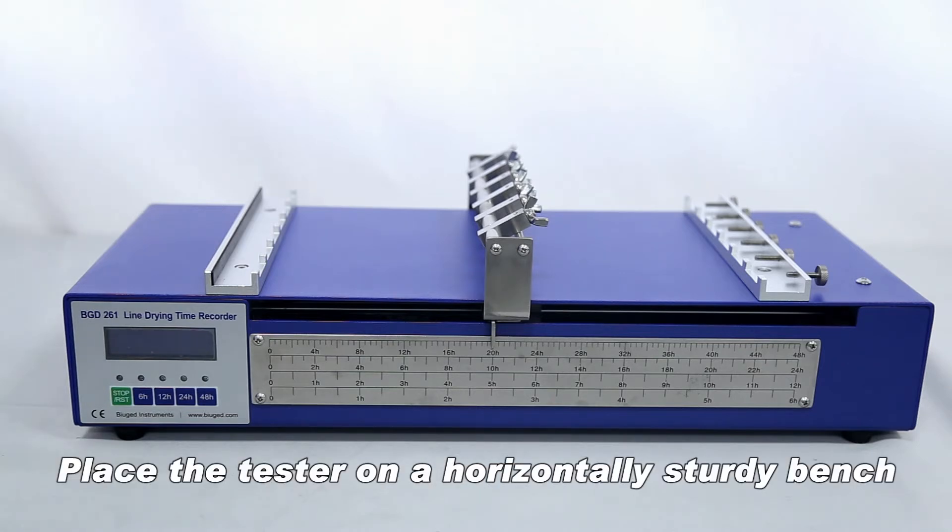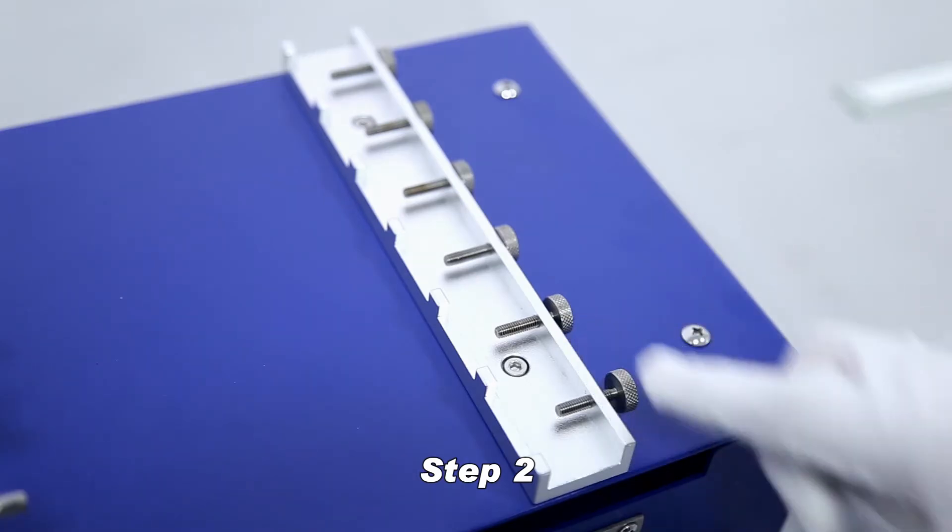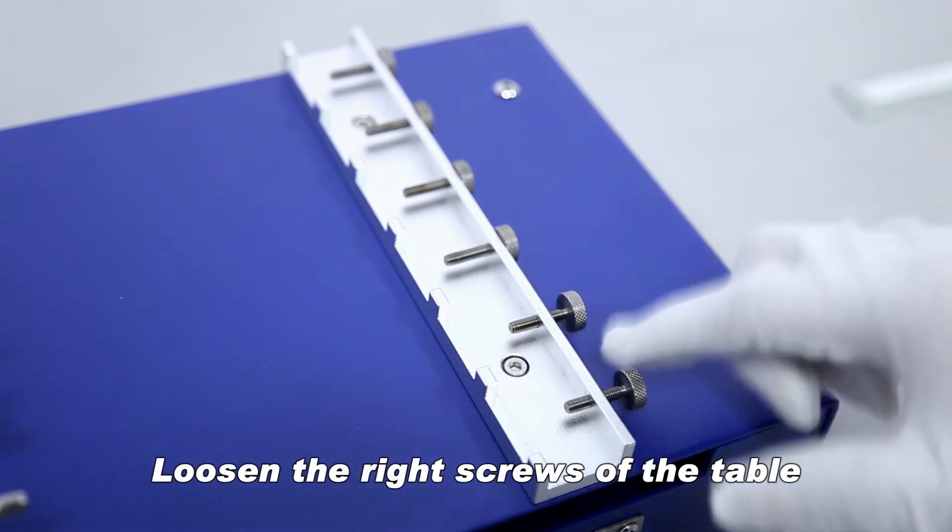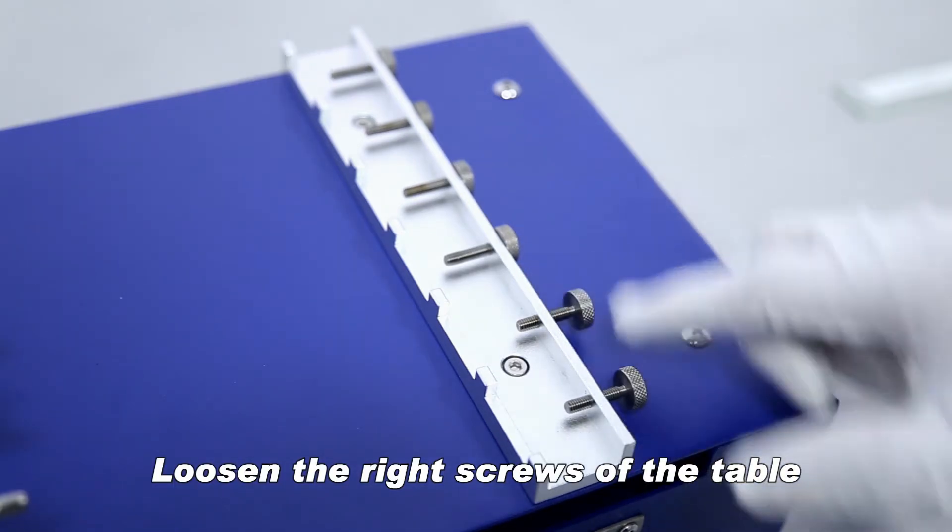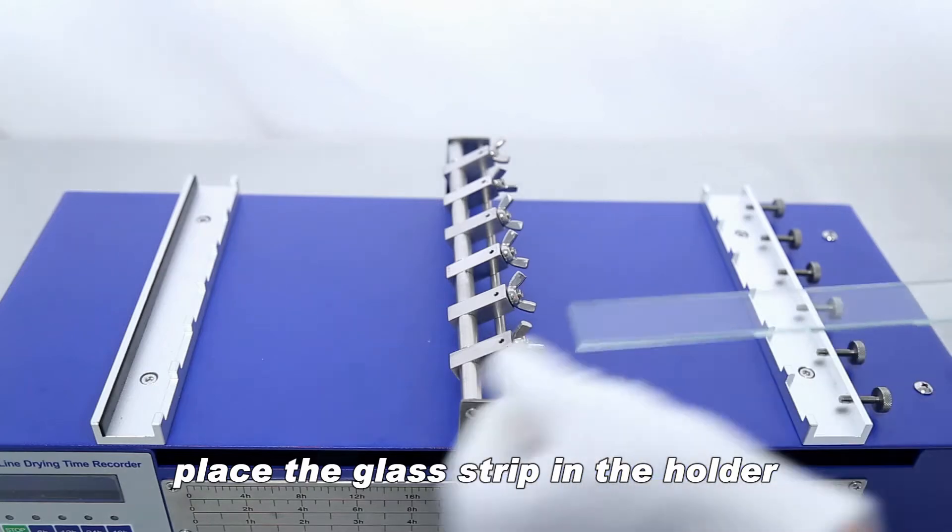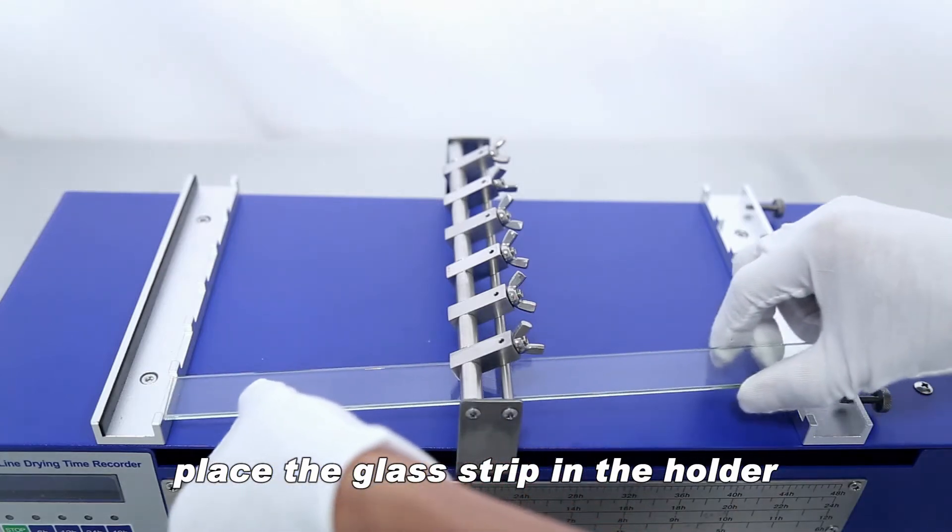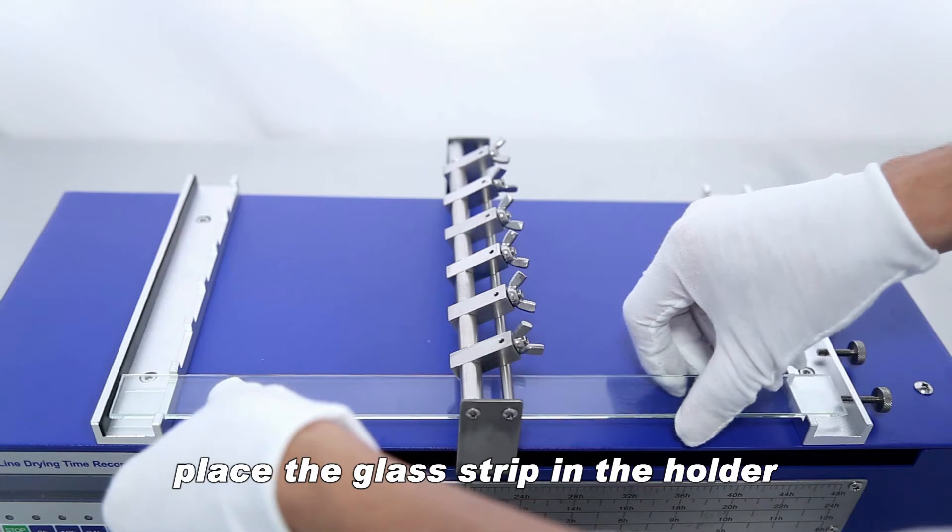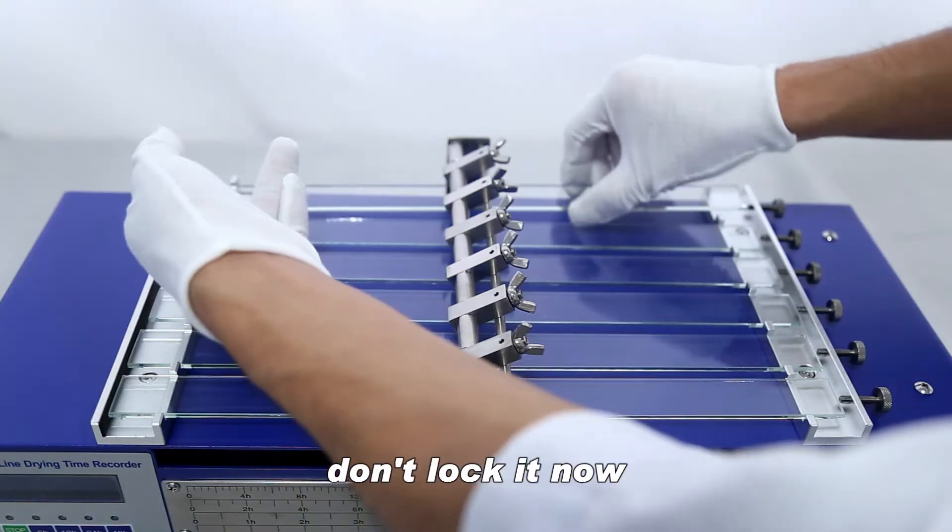Place the tester on a horizontally sturdy bench. Loosen the right screws of the table. Place the glass strip in the holder. Don't lock it now.